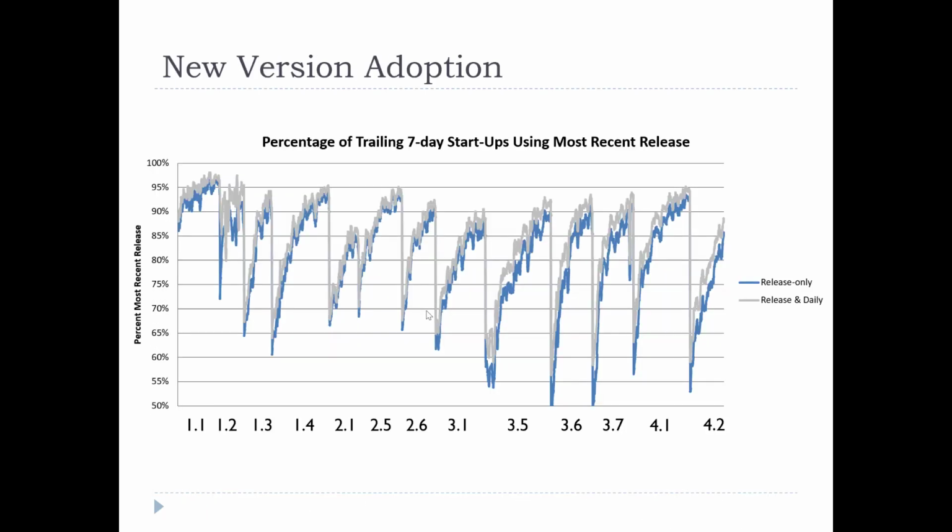This is a view that shows new version adoption, which I pay a lot of attention to. It's a statement that we keep Skyline robust and high quality throughout many cycles of development and releases. I created this view because if we got stuck down here at 85% or even 70%, that would be a problem.